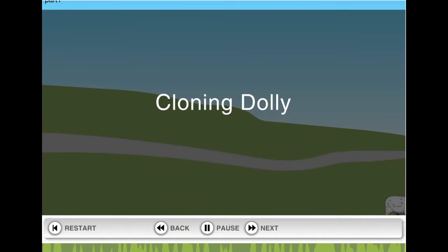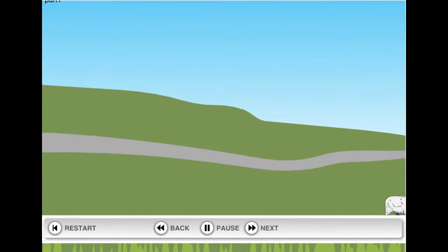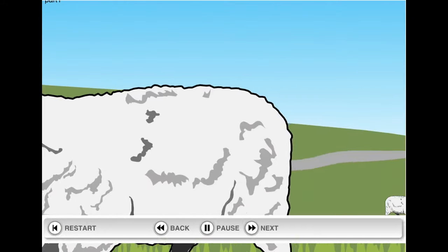This animation outlines the process the Roslin Institute scientists followed to create Dolly, the world's first mammal to be cloned from cells taken from an adult Dorset ewe.